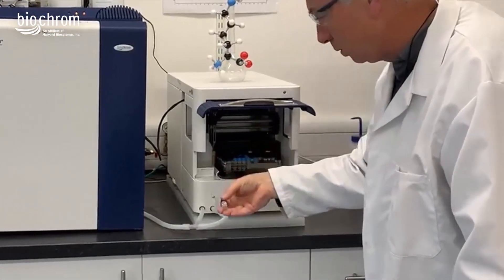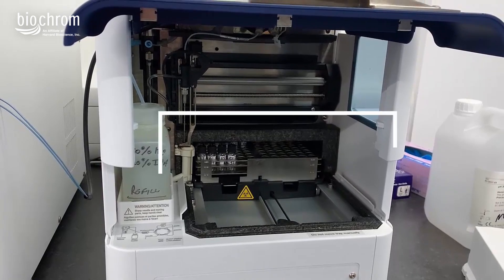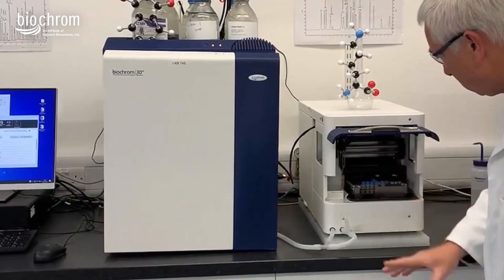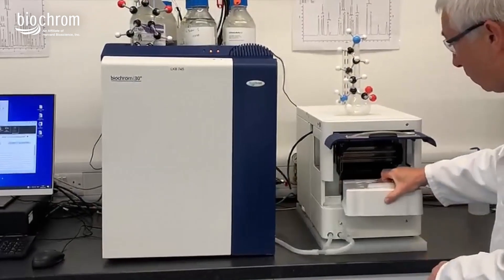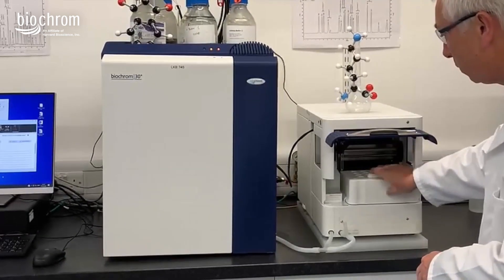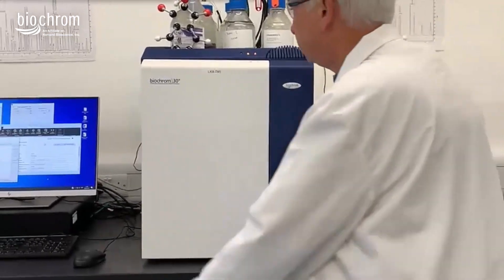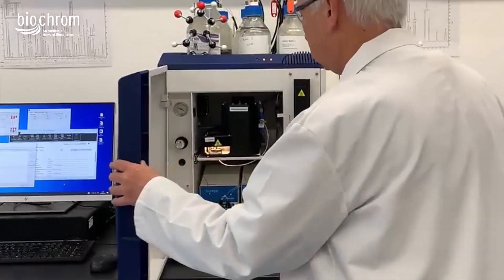The samples go into this grid here and they move in and out on a track. That's an 84-sample tray. The auto sampler can be cooled or not cooled, so that is part of the temperature control system he's putting in there. This is configured as a physiological system.